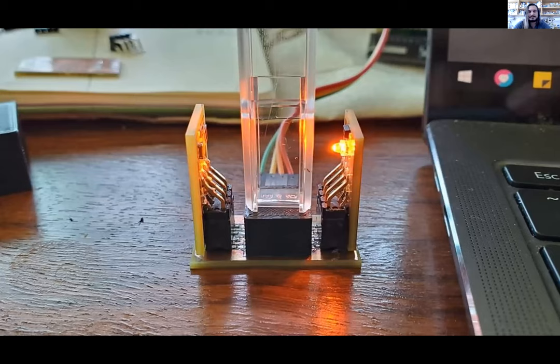And so I came up with this, right? Super, super simple design. I found a really awesome light sensor that does light to digital. So you don't have to do all the analog black magic involved in measuring light, like photodiodes and transimpedance amplifiers, all that crazy stuff. It's all embedded in the circuit. So all you need to do is have a microcontroller go, hey, what's the value on this? And it just gives you an actual number directly. All the conversion of analog to digital is on this chip. It's wonderful. And it's now extremely out of stock because of COVID stuff.